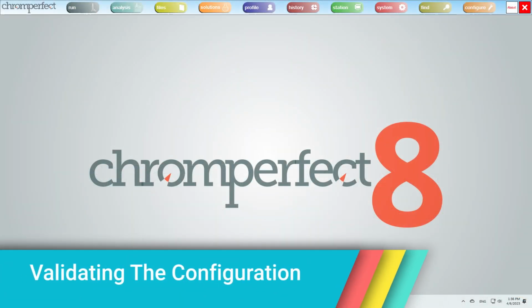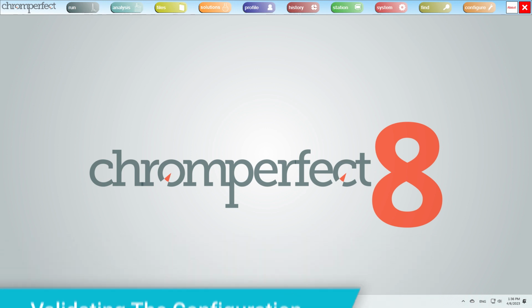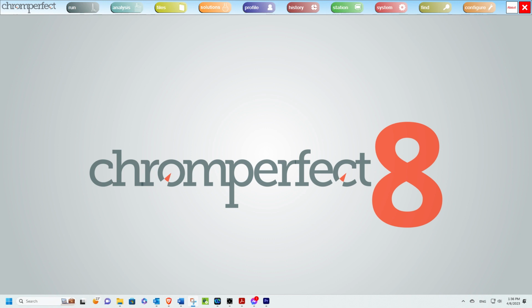Validating the configuration. Because ICF instruments are configured in two places, Chromperfect and the ICF, these separate configurations must agree. The IP address in the Chromperfect configuration must match the name of the ICF configuration file in the inst_ICF directory.